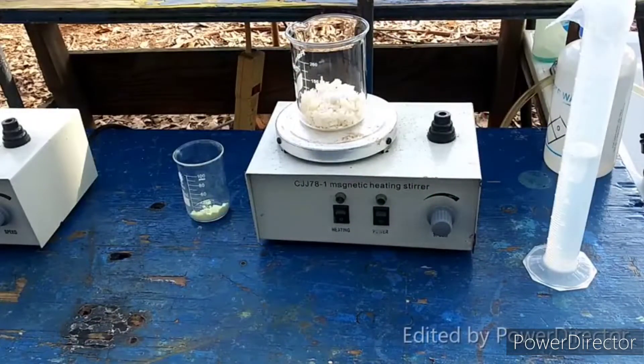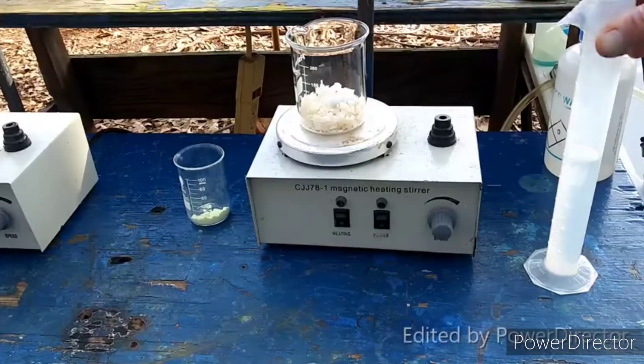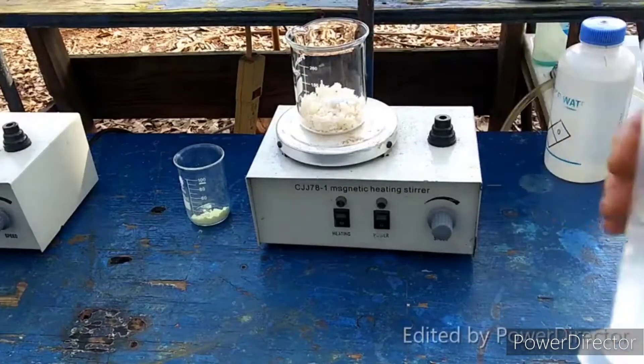We're going to be doing the reaction at half scale from what it gives us in the textbook, just because the textbook makes up a huge amount of this stuff and I don't need quite that much. So the first step is to dissolve 36 grams of sodium sulfide nonahydrate in 50 mils of water.